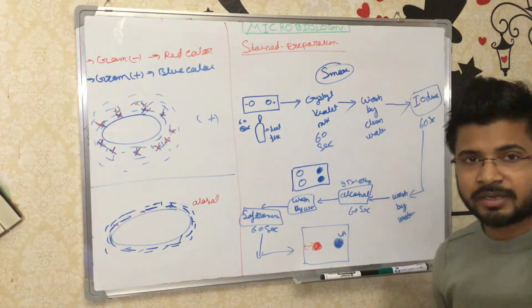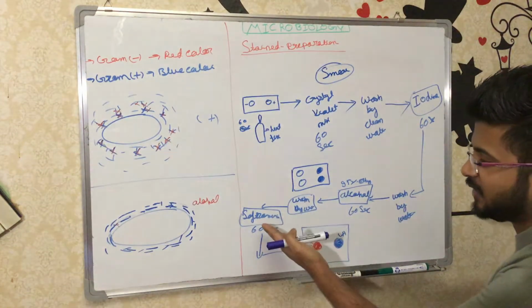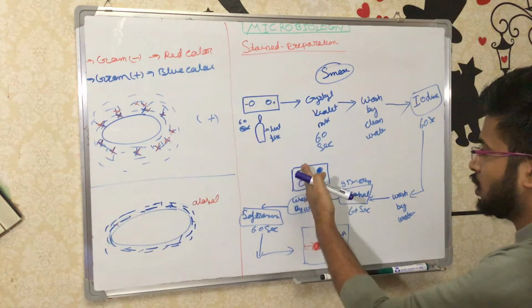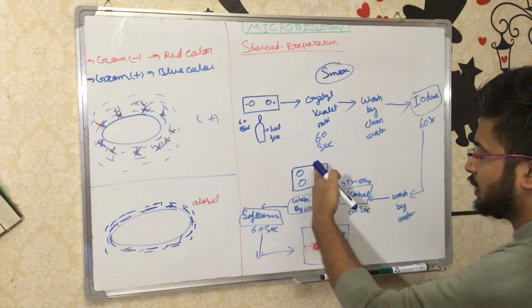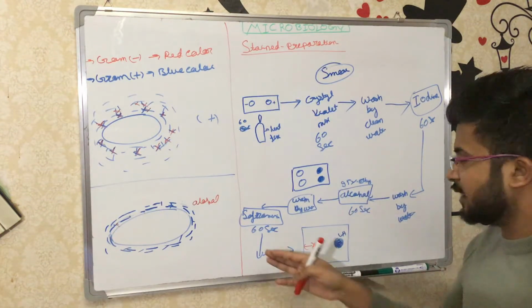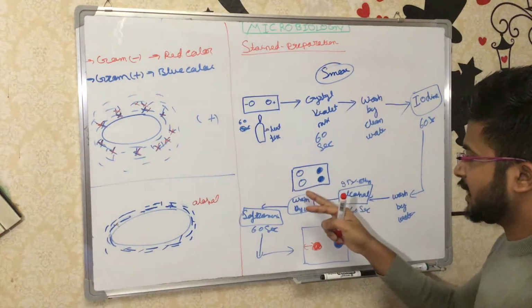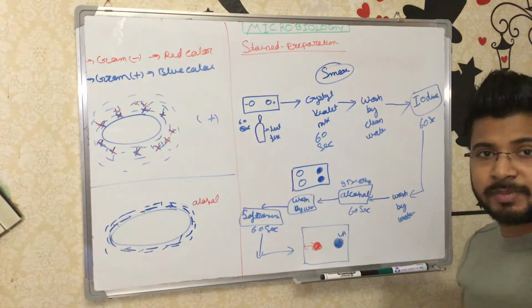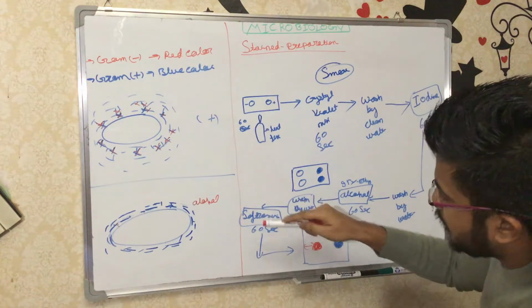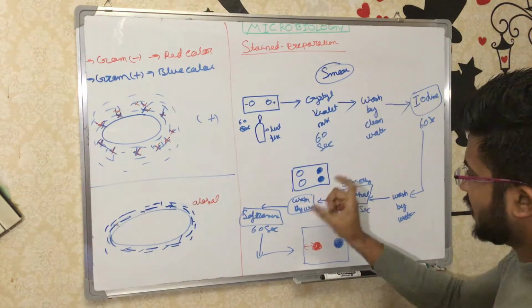But for the gram negative bacteria, again we add safranin, or red color. Safranin will go here, and it will now be colorized by the red color, because the gram positive is already blue, so red will not affect the blue area. This will affect only the gram negative bacteria which were already decolorized by the alcohol. So the slide is flooded with safranin liquid by the dropper, and spread on the slide.